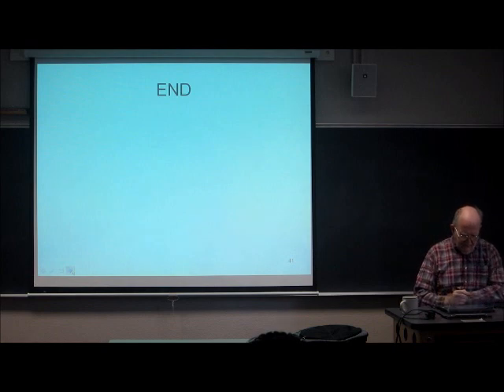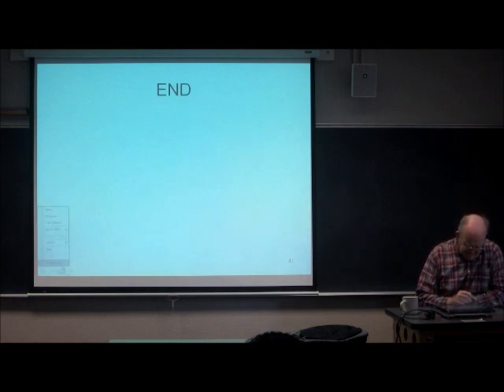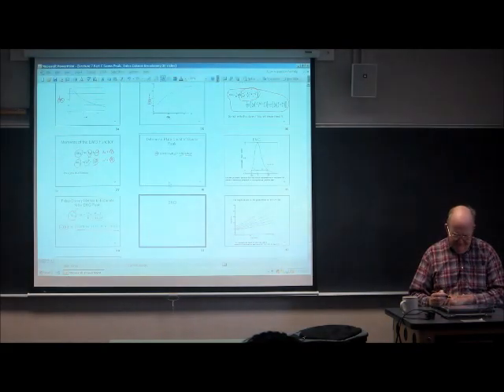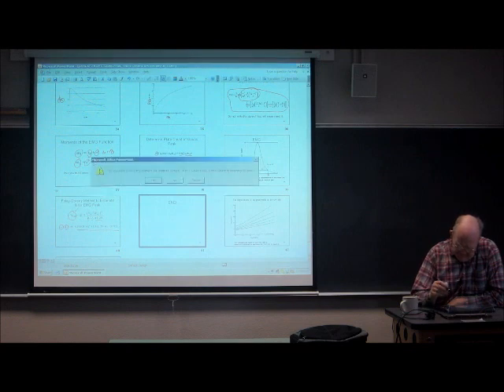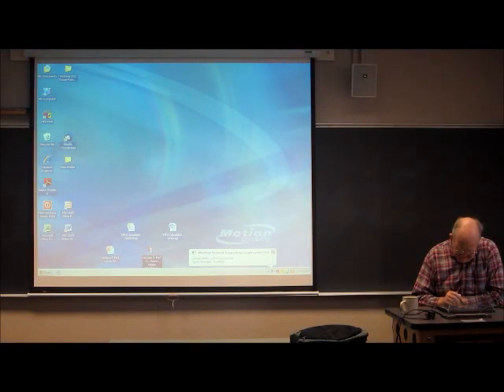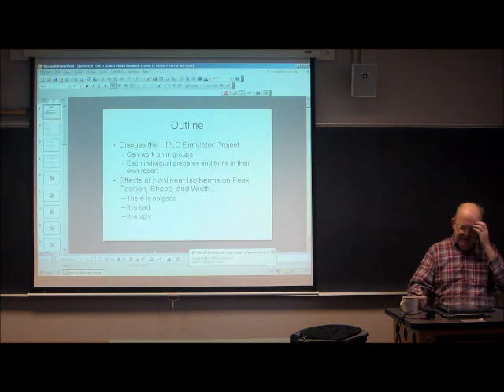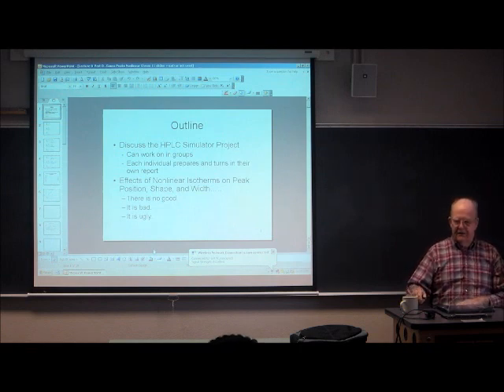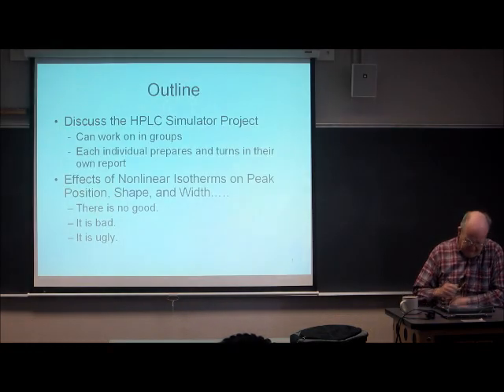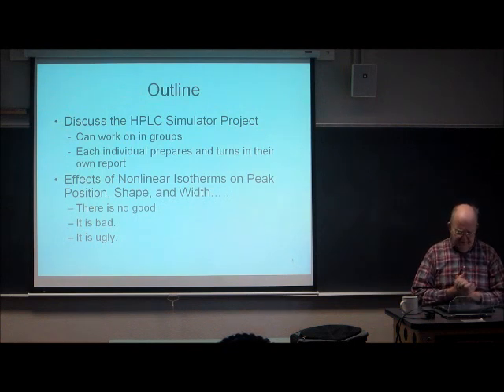And I'm going to change gears now to something which is very important. And that's what happens when the chromatography is done with a nonlinear isotherm. In general, this is an extremely difficult subject.